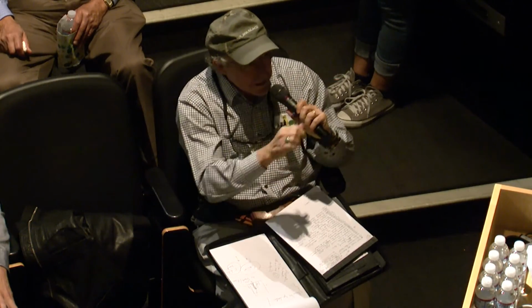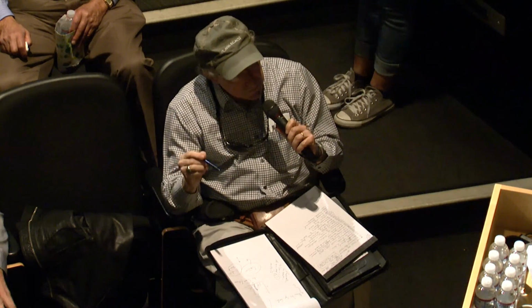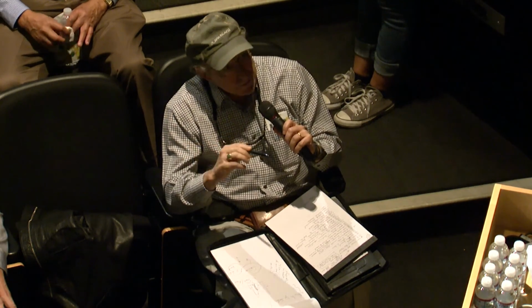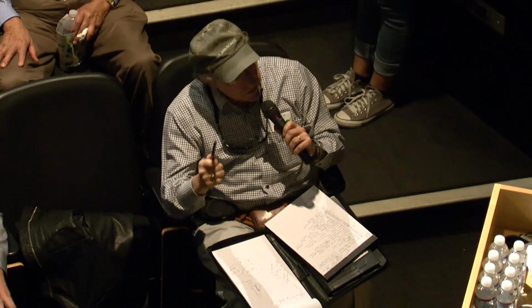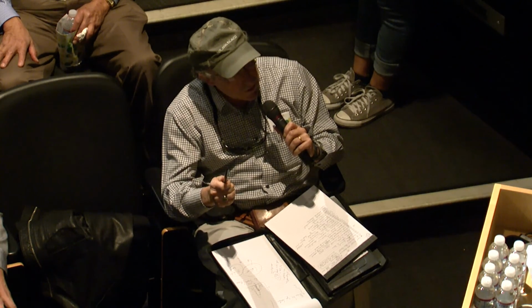So I was excited by your approach to dilating time. And I wondered if you'd tried that yet with the Caviar probe in the heart and the zebrafish, because there should be some fine structure to that propagation, both the calcium and the voltage. And then second piece of that question: have you tried putting this probe in close association with one of the key channels, like the sodium channel?